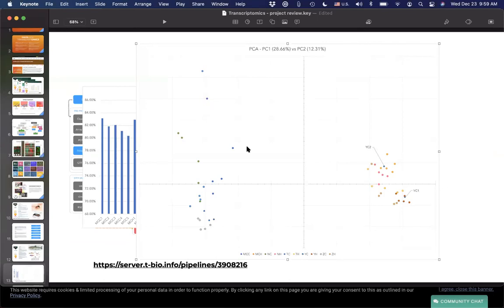So you have 5 inbred controls and 5 inbred heat shock, right, and then the rest could be grouped together. Yes. So you would have 4 classes: inbred control, inbred heat shock, the rest control, the rest heat shock. Yes. And then you would want to select genes that show this kind of classification and good separation between these classes. I mean, I think that's reasonable. You should probably try that out.